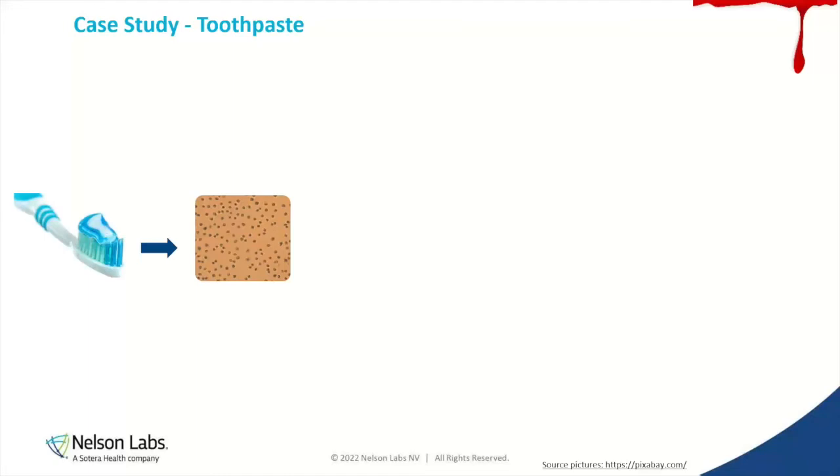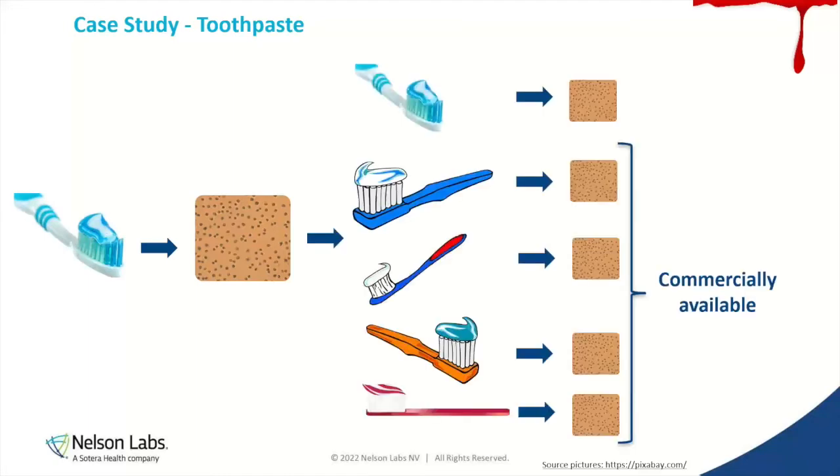So what we did is we said, okay, take your product and compare it to several other toothpastes on the market. They will have different components. Their product was more prescriptive with certain ingredients. However, just in general, to show the regulatory agencies, like, yes, toothpaste is not going to pass cytotoxicity without some dilution. We expect it to show cytotoxicity, especially because we want toothpaste to kill germs, right? So it's cytotoxic to some extent. So we ran several dilutions compared to several different types of toothpaste, popular ones on the market used by a variety of patient populations.